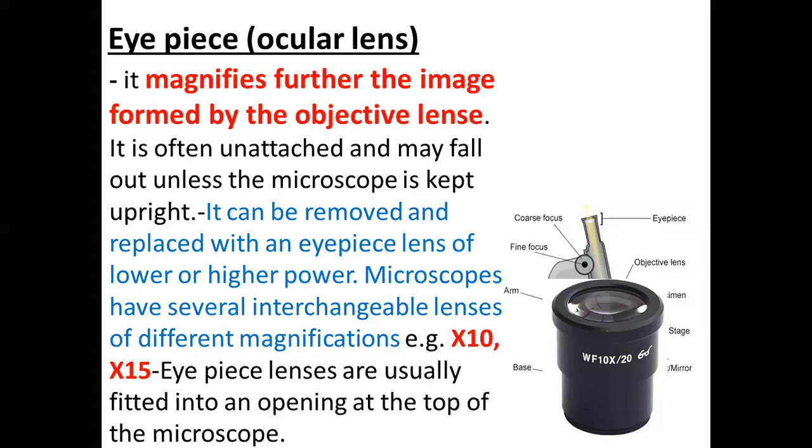We know that microscopes start working from the lower part, the objective lens, then going upwards to the eyepiece lens, this one. But remember, we have eyepiece and we have eyepiece lens. The whole of this structure now is the eyepiece. This part is the eyepiece where I'm putting the spotlight.